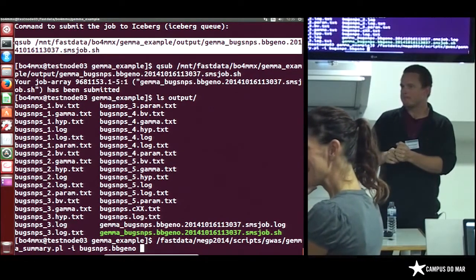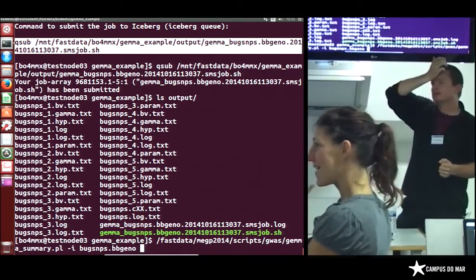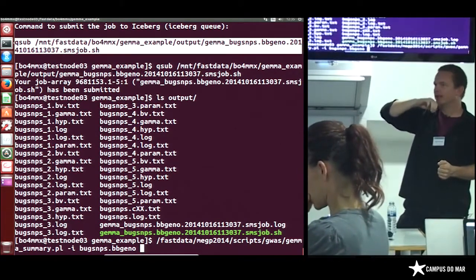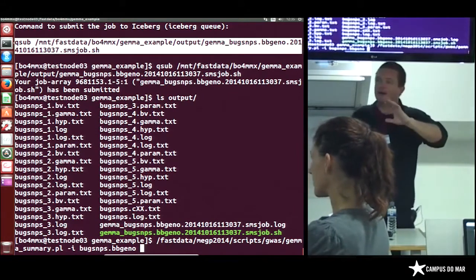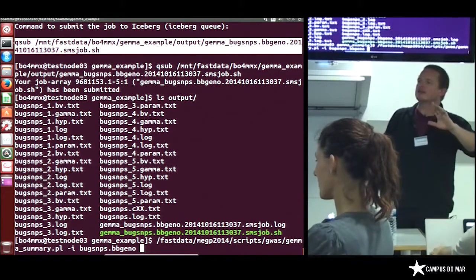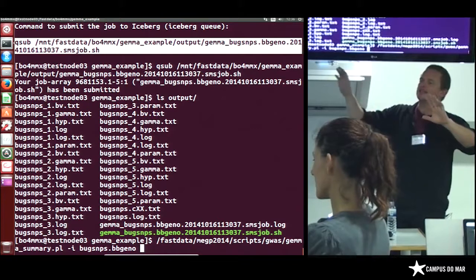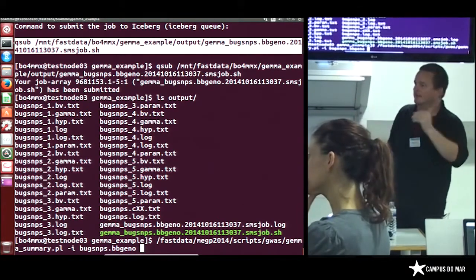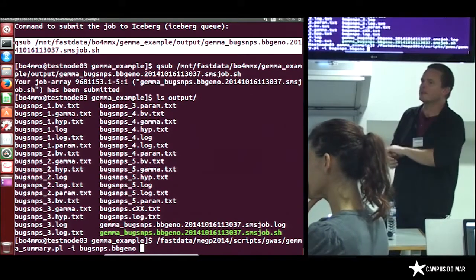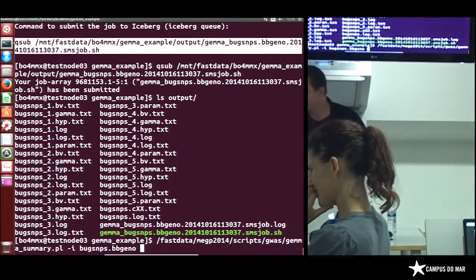Because I get the line, but what... Yeah. And then we ran a model. And in that model, we asked, what's the association between the phenotype and each SNP? And we went through individually. And I'm going to show you the summary output in a second, and I'll explain what the numbers mean. Hopefully.